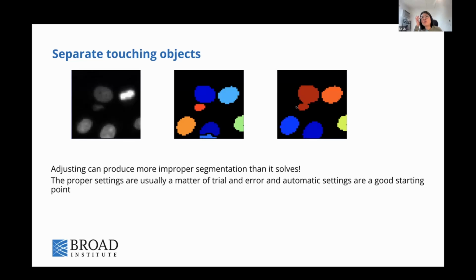A good approach is to check the whole image and get most of the segmentation good, and then look at how many objects are over segmented and how many are under segmented. The ideal would be that over and under segmentation are present but the ratios are similar. Then you can move to the downstream objects.